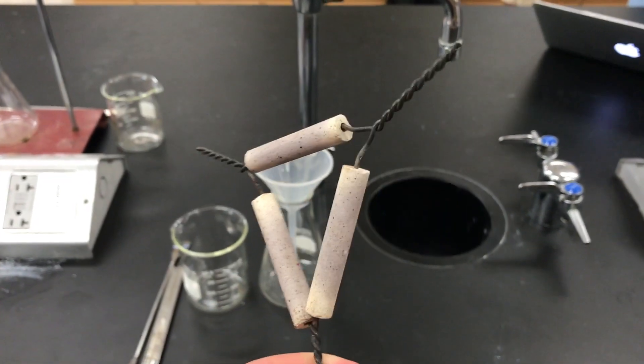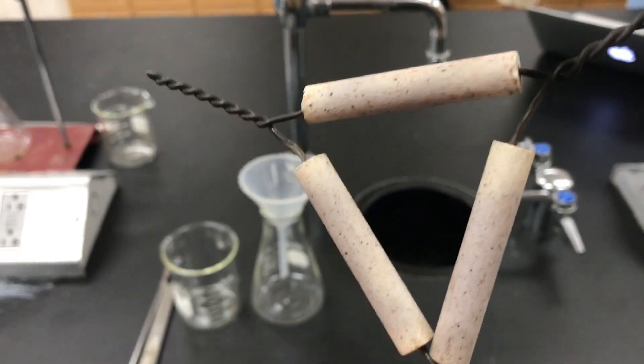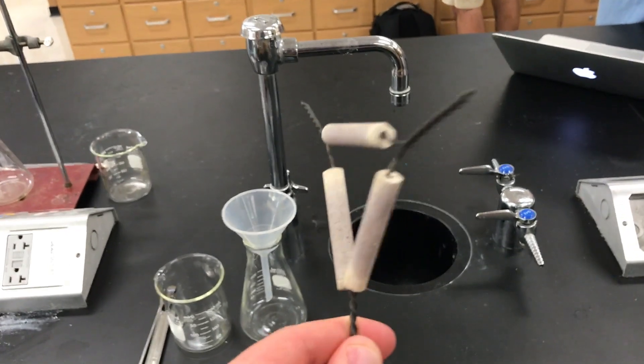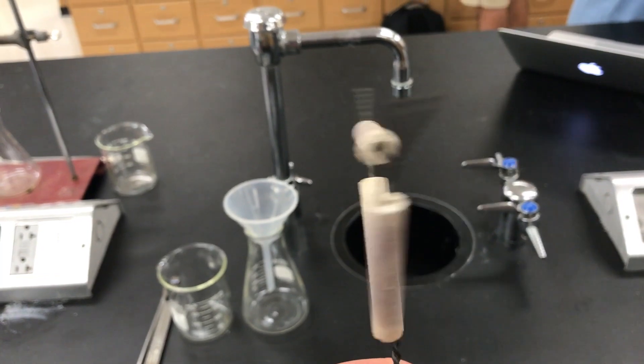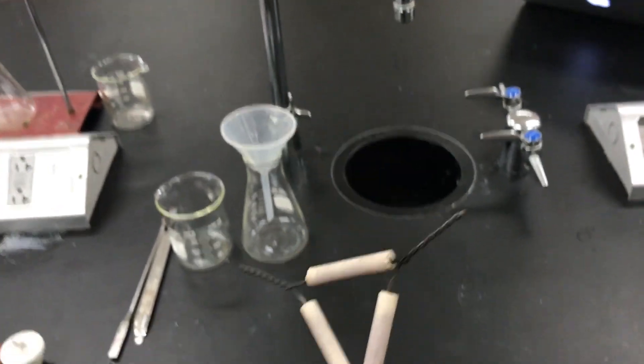This is a clay triangle. It's a piece of laboratory equipment. It's used to support a crucible. It can be heated over a Bunsen burner. It is made of wires and clay.